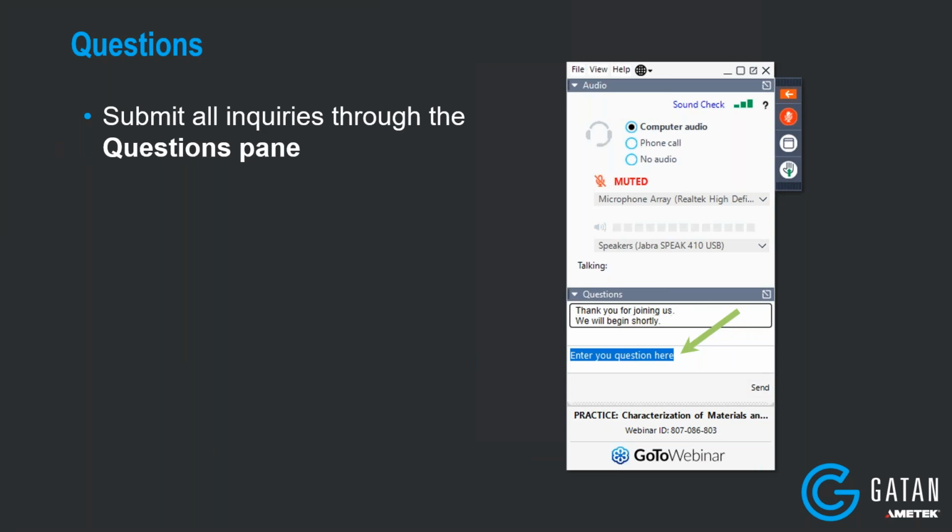We can install this at the end of the GIF. And also, I think one of these data sets was acquired using the K3, again a direct detection counting camera, that can go above or below the GIF.